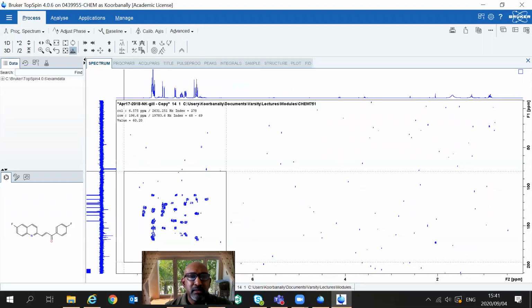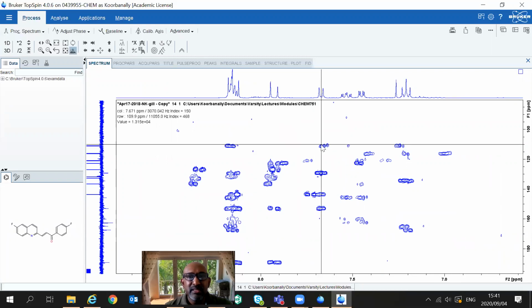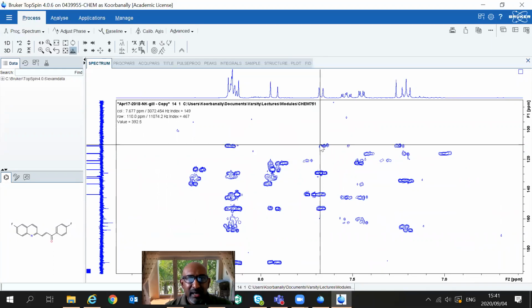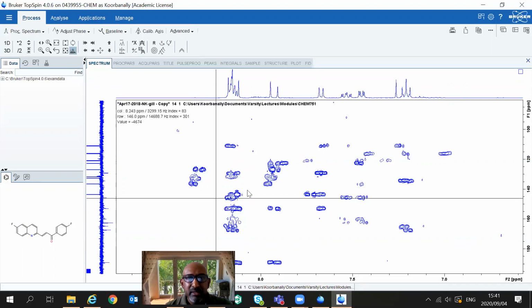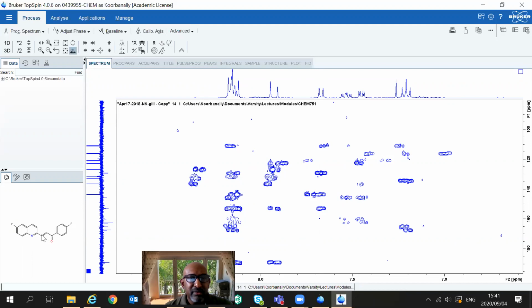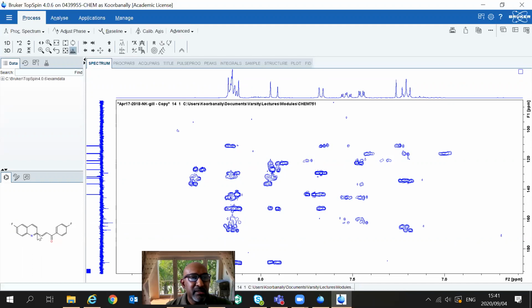All right, so I'm just going to expand this part here. So I also saw something at 110 for this resonance, right? And the 110 was actually this particular carbon. So that's the only proton that I'm a little bit ambiguous about. Although I have 4 correlations here, I have a correlation for this proton to that particular carbon, and to that particular carbon. I've got a correlation here around 142 to that particular carbon, and a correlation here to that particular carbon, right?